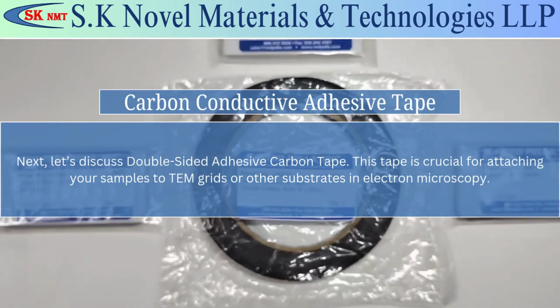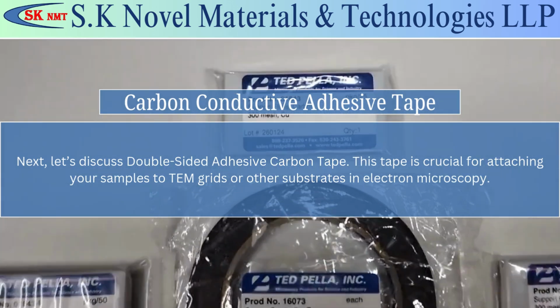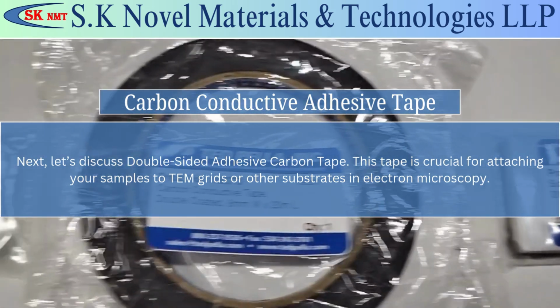Carbon conductive adhesive tape. Next, let's discuss double-sided adhesive carbon tape. This tape is crucial for attaching your samples to TEM grids or other substrates in electron microscopy.